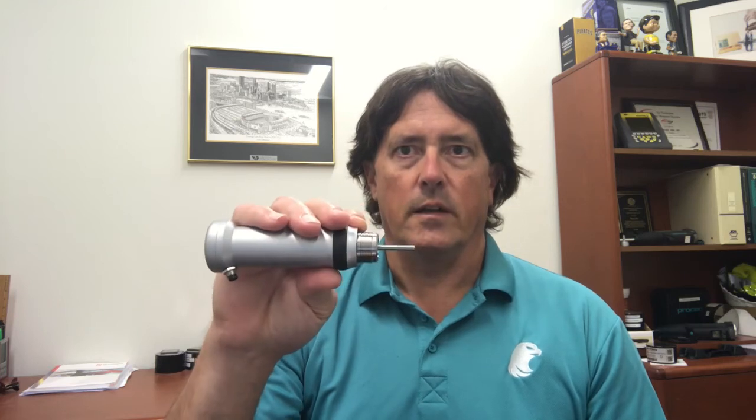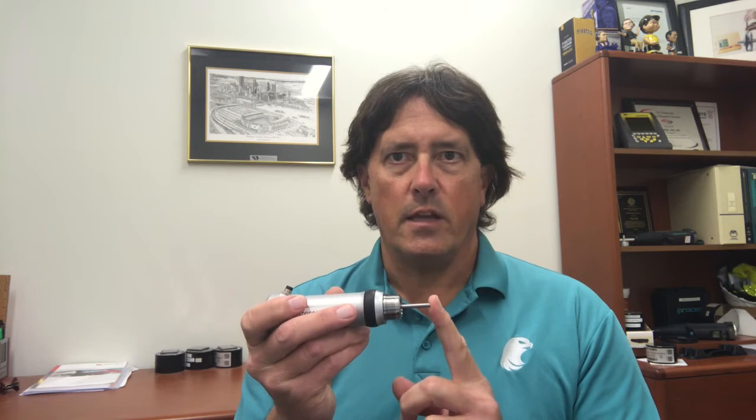What's going on in UCI — ultrasonic contact impedance? We have a probe, and if I remove the protective shell, you can see we have a Vickers diamond mounted on a metal rod. When it's turned on and connected, that rod is vibrating at a set resonant frequency. We tell the probe what test force we want, and as we press that diamond into the material, that resonant frequency changes — it shifts. Softer material means a deeper indentation and more of a frequency shift. In a standard Vickers test, you apply the force, remove the diamond, and measure the indentation size. Here, we're inferring the indentation size by the frequency shift of the resonating rod.